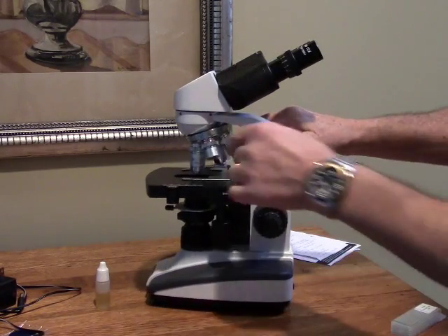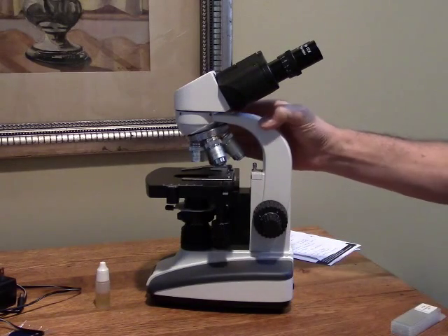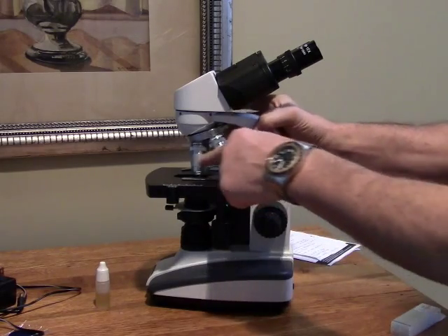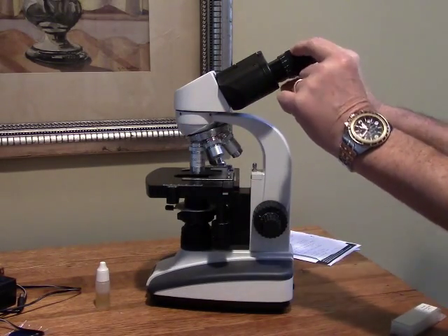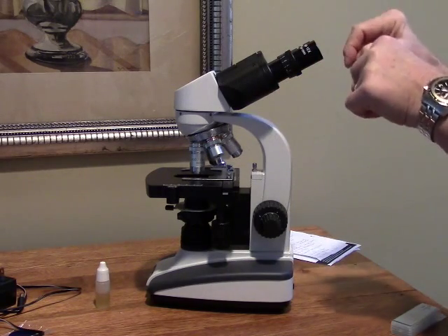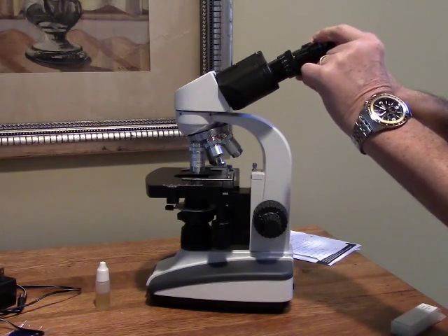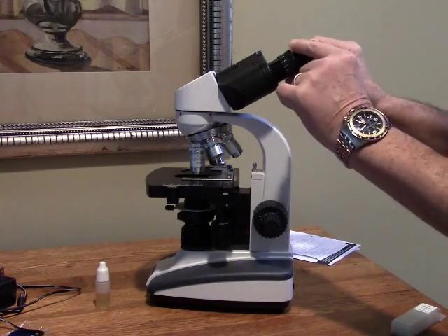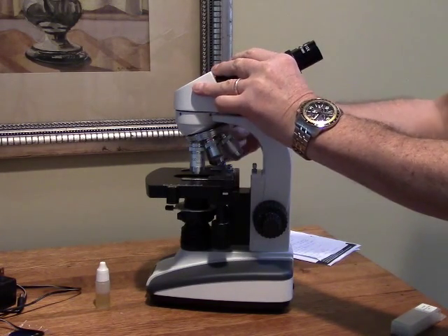This has four objectives: 4x, 10x, 40x, and 100x. The eyepieces are 10x and these are wide field eyepieces. No eye cups are provided and there is no set screw to hold the eyepieces in, so it's important to know that the eyepieces have to be installed when you get the microscope.